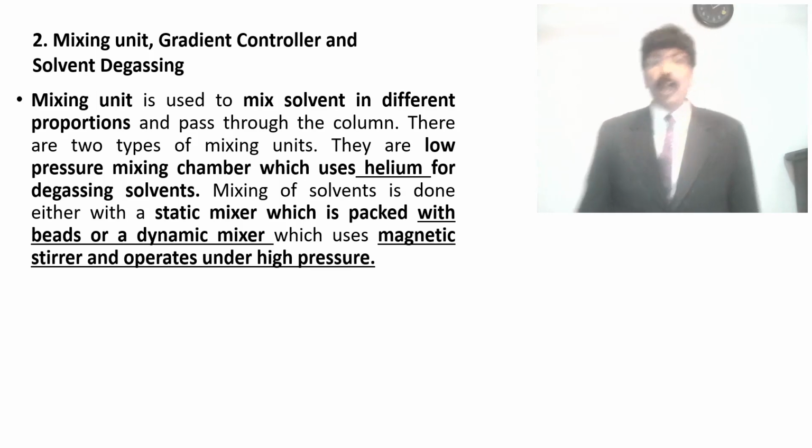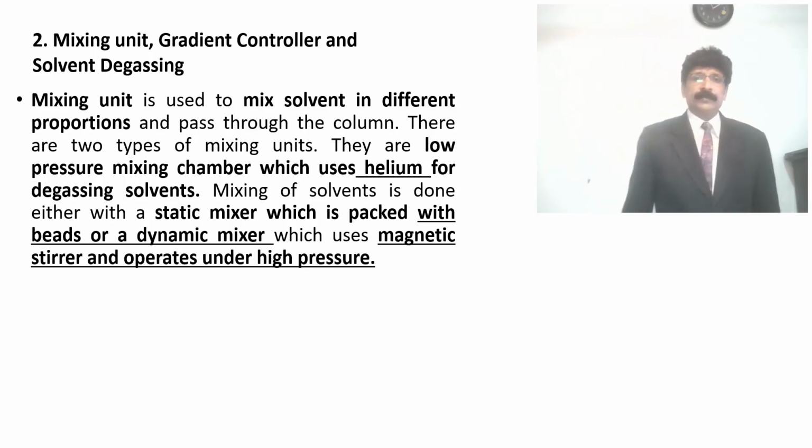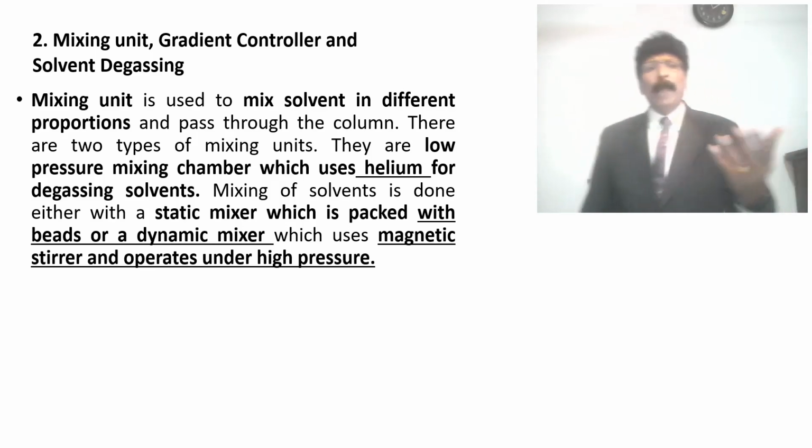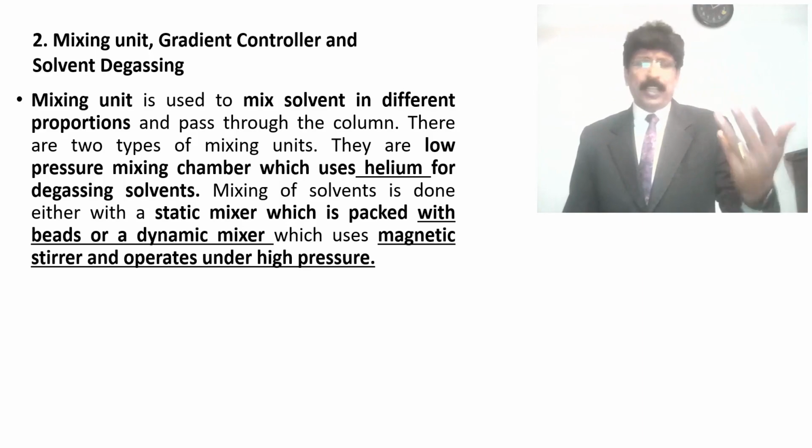Mixing the solvent is done either with a static mixer, which is packed with beads, or a dynamic mixer, which uses a magnetic stirrer and operates with high pressure. These are all stirrers which you might have studied, and they can be used for mixing.